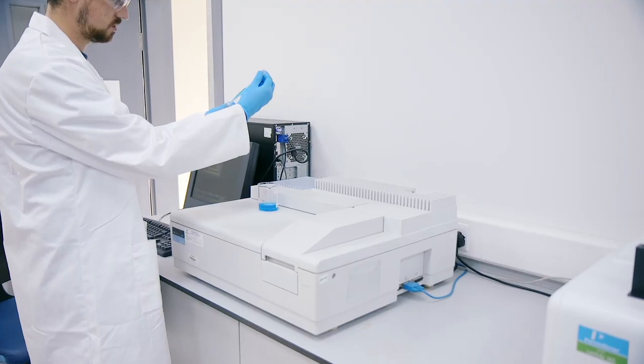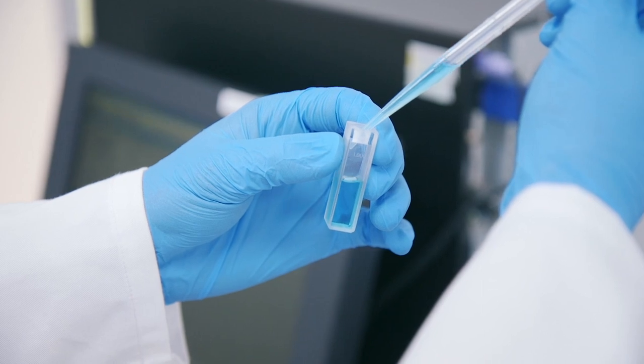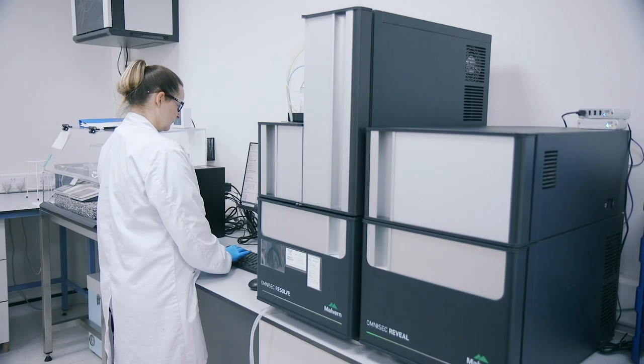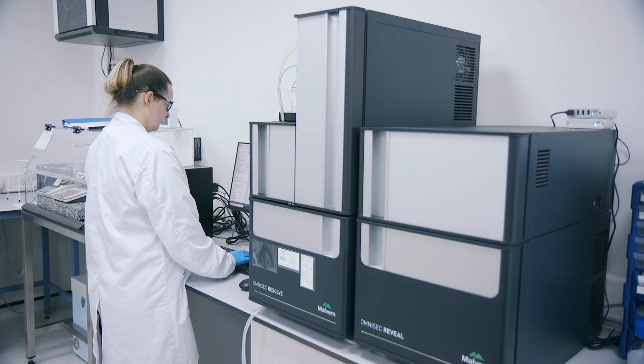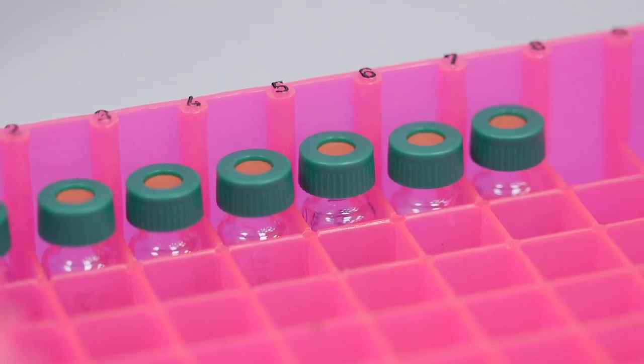Also here are our PerkinElmer UV-Vis spectrophotometer and the Malvern Panalytical Omnisec Reveal and Resolve. This is a size exclusion chromatography system with multiple detectors: UV, viscosity, RI, and light scattering, which are configured in series for optimum sensitivity.